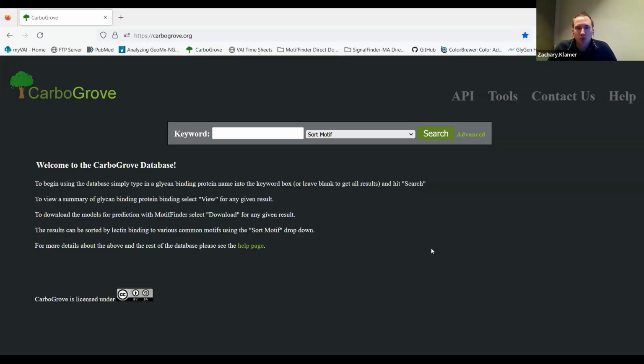Here we go. Share. So now you all should be able to see the website. Before I get into the website demo itself, I want to briefly mention that we worked really hard the past couple of weeks to introduce a new update for CarboGrove. So if you've been to CarboGrove before, you'll see new things here.